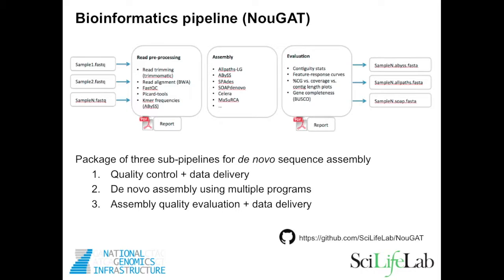Second part is the assembly, and it supports a wide range of assemblers. We usually run 2 or 3 at a time for each project. And lastly, there's an evaluation pipeline. I will talk more about this on a later slide.